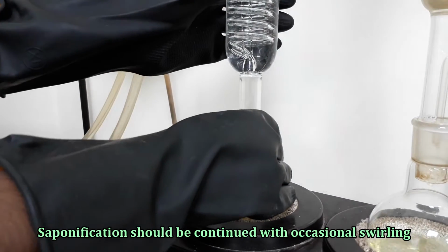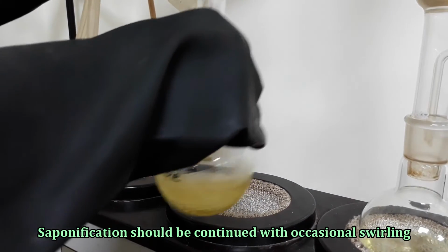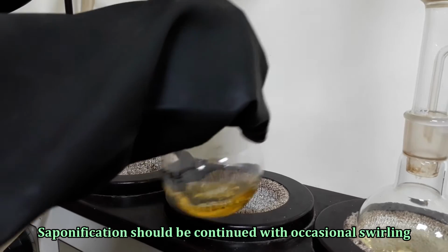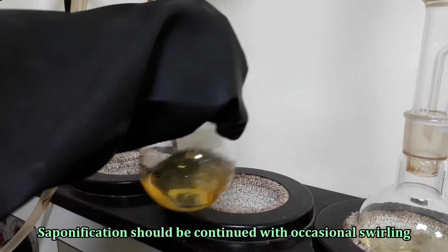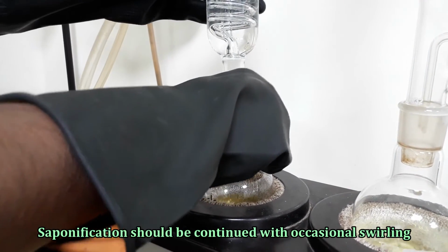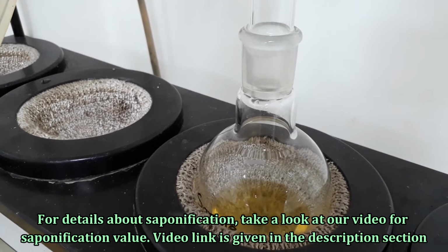Occasional swirling is important during the saponification. No loss of alcohol should occur during saponification.